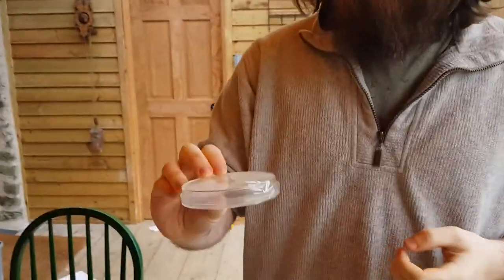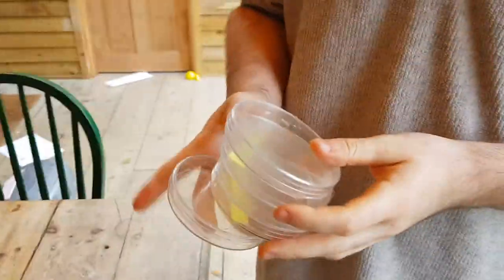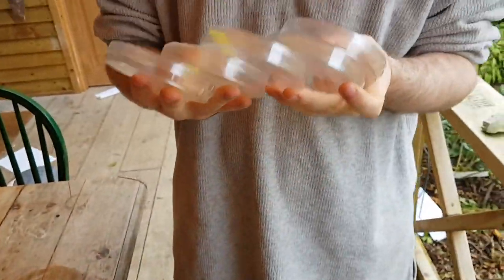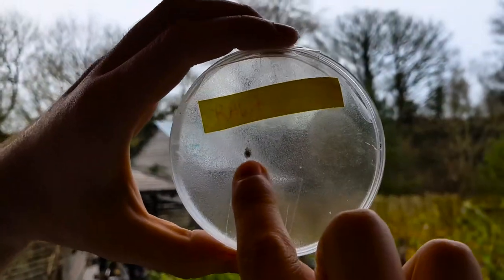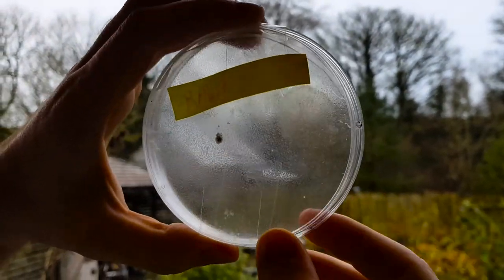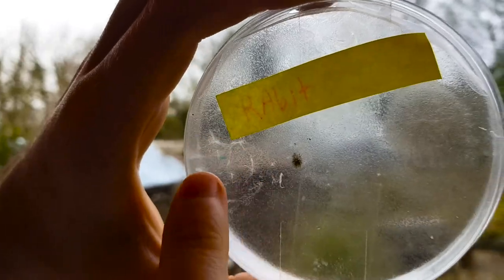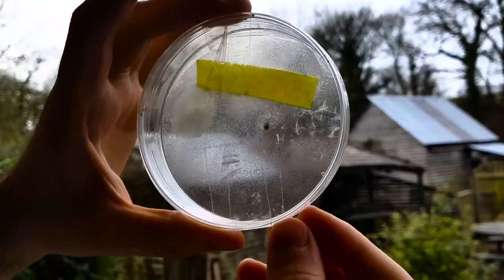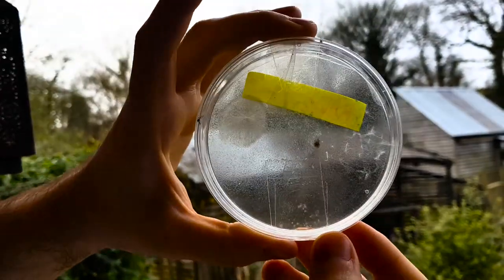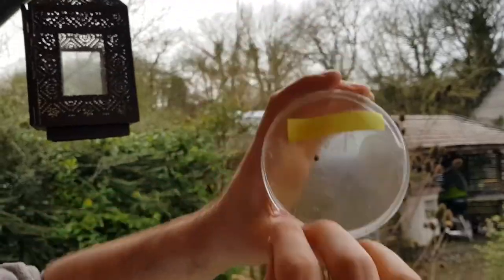So it's been a few months, and not much has happened. It's a rabbit. We've got this, which is most likely infection. We've got this fluffy stuff over here. It looks more fungal to me. That's typically what mycelium does, but I'm not sure. I don't know enough about any of this.